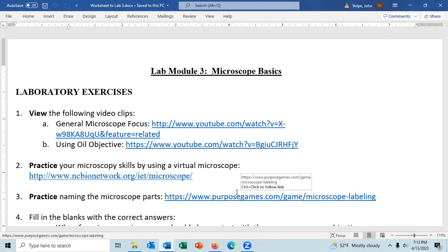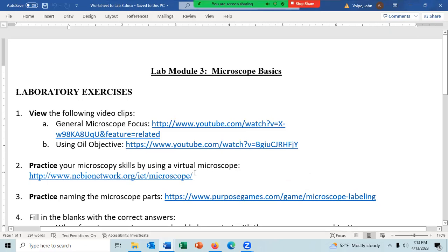So we have some video clips for you to watch on general focusing, and then adding oil to the oil immersion slide and objective. And then practice your microscopy skills by using the virtual microscope. Let me see if that works. It does work on your copy. I'm not sure it works on my teacher copy.